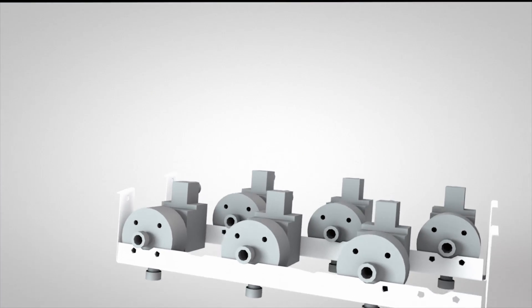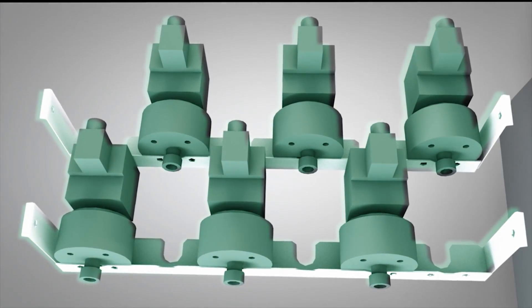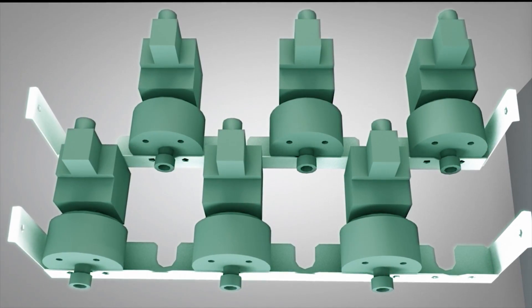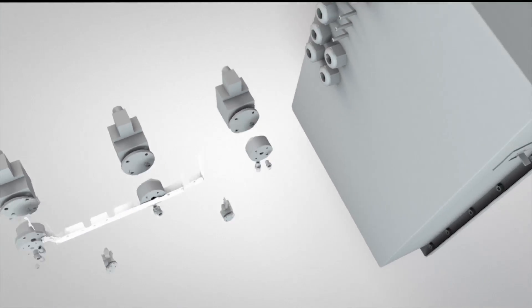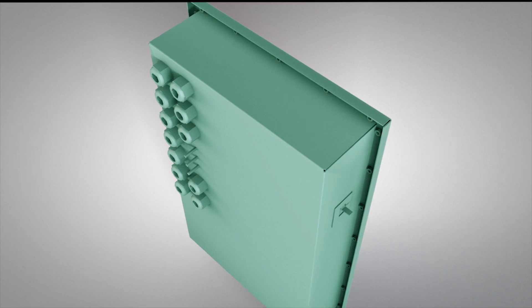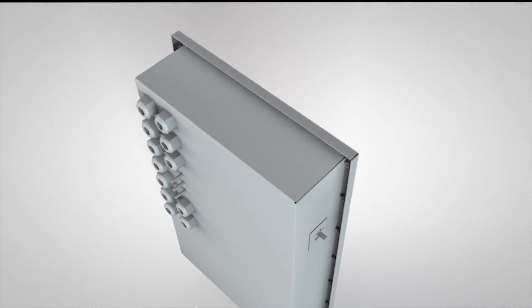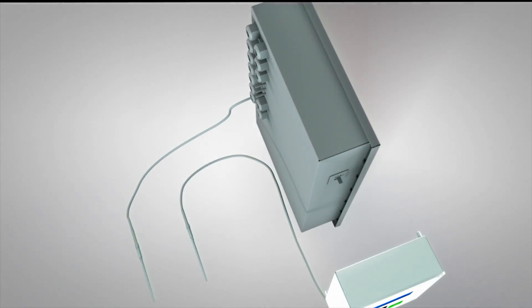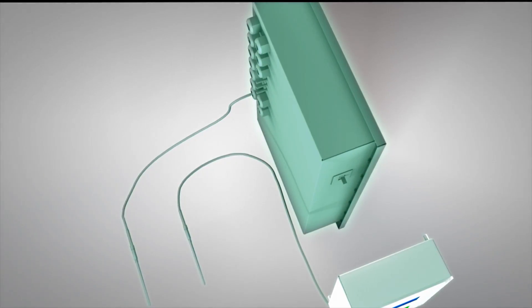Another unique safety feature is that valves inside the Soxrock instrument are made of Teflon and EX-clast, which reduces the risk of accidents caused by solvents. The main electronics are contained in a pressurized box to prevent contact with the solvent. As an extra precaution, the temperature monitoring is achieved by two separate redundant safety systems.